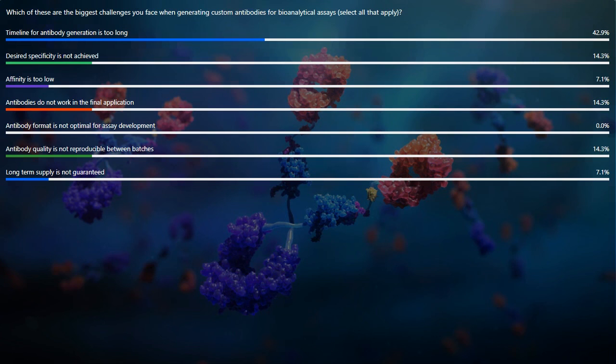Yeah, thank you, Annie. So I hope in the presentation you saw that both specificity, I spent a lot of time discussing that, but the timeline of phage display is quite a fast process. The actual workflow with no additional extras is 8 weeks, and after 4 weeks you have a reasonable indication of whether your project has been successful and that you know whether you've got hits that can be taken forward for expression and purification. So compared to conventional classical animal immunization based techniques, it is a fast process.